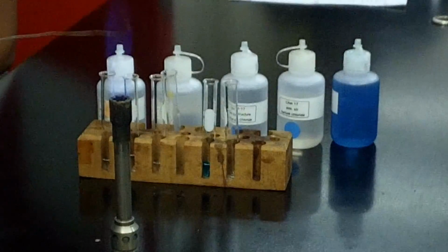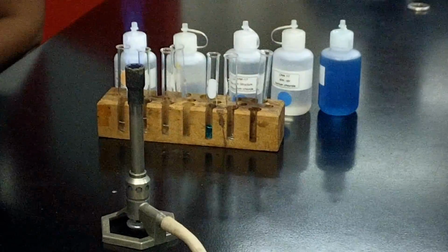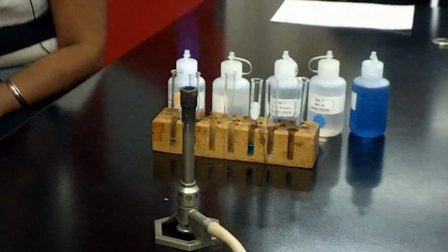So again, we go back and we'll use the different one. Well, don't use a different one. Just use the hydrochloric acid and burn off the color. So we're trying to get this clean. See, it's clean now. All right? So we'll go to another color here. This one's going to be number 3. This is potassium.